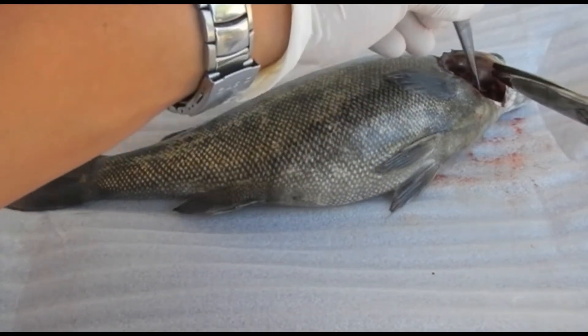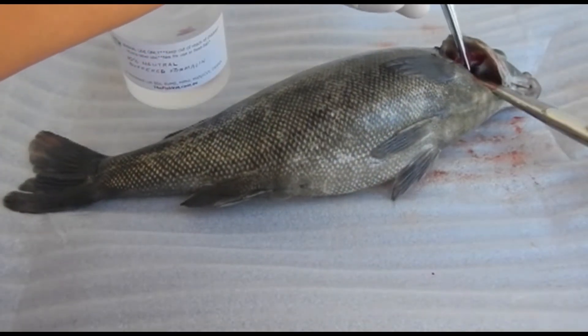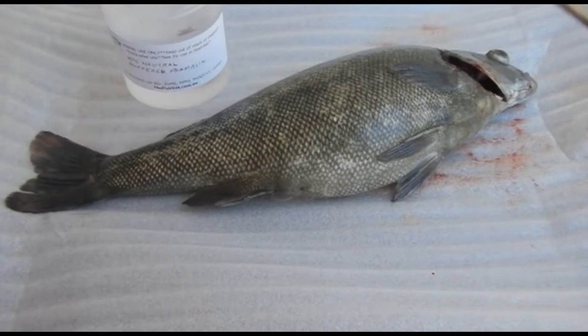Notice when I'm cutting the gills, I'm holding it by the gill arch and cutting either side of the gill arch, taking care not to damage the gill filaments.